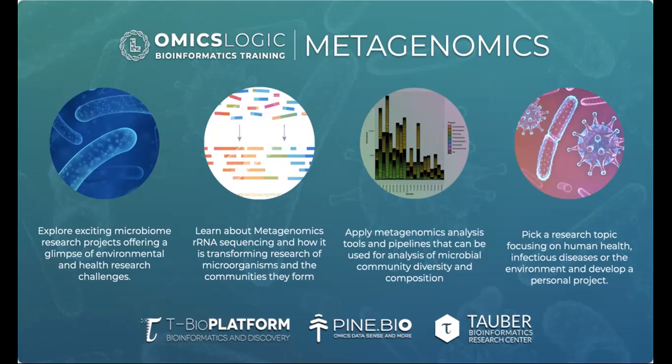Before we begin, let's discuss how sequencing technology has helped us to study microorganisms, and how the data analysis tools developed for metagenomic studies are used to characterize microbiota and ask some important questions about the microbial community. How these have expanded our view to understand microbiology.